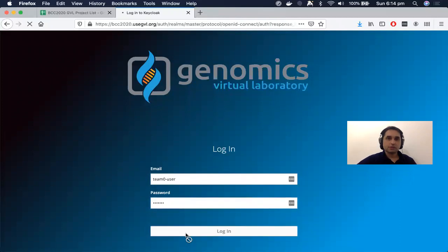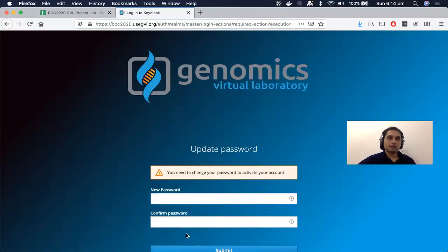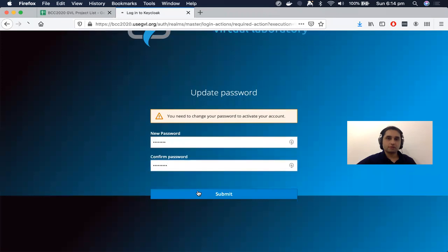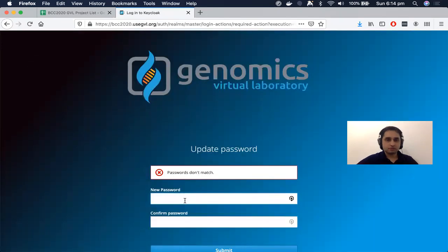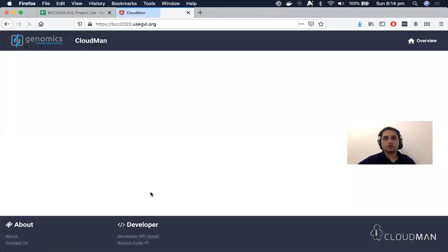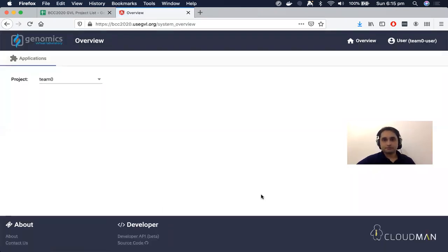Once I log in, we will first be asked to change the password. So I'm going to change the password to, set any password you prefer. And once we've submitted our password, we will be taken to the GVL homepage.